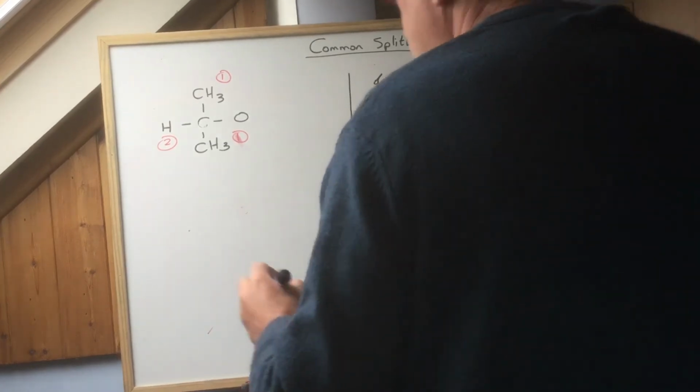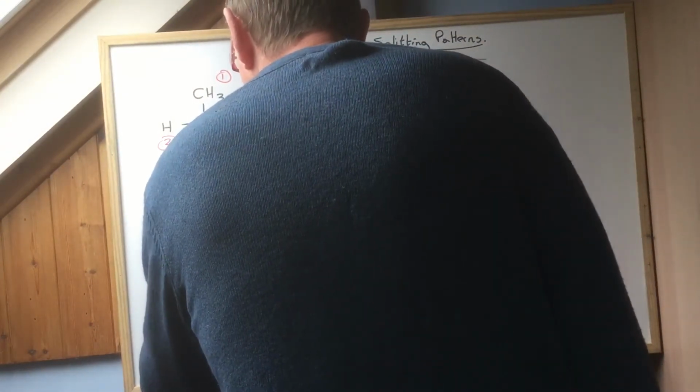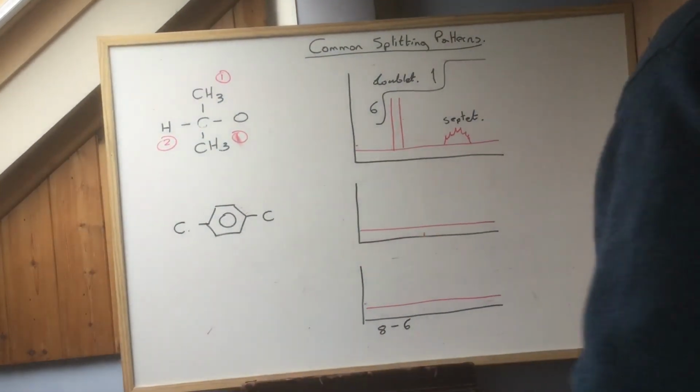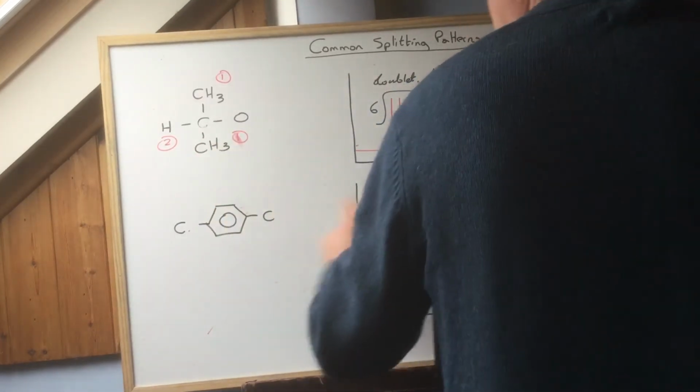Okay, I should have probably done this one first because it fits in with the monosubstituted benzene ring. How about you get something like this? What do you expect to see? Because of course I'm always going backwards. You take that and you deduce that, and you take this and you deduce that.